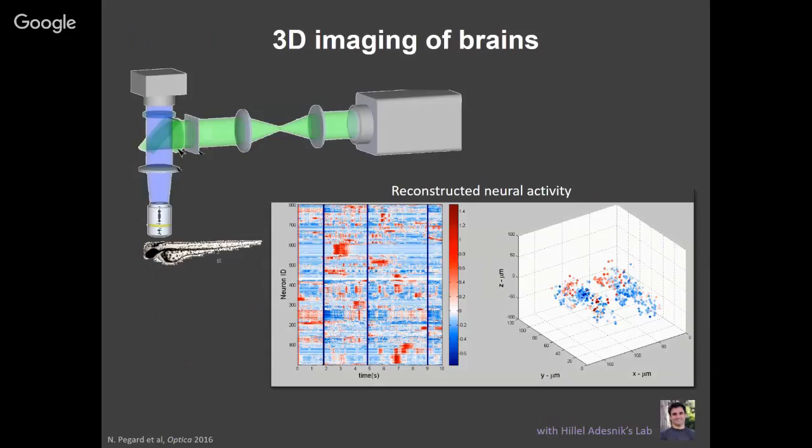Okay, so then finally, we can do exactly what we wanted to do, which is to track the activity of every neuron over time. And this is a map. This is the 3D map of where the neurons are, and then the color represents their activity at a particular time. And this particular experiment is just this zebrafish hanging around, not really doing much. So it's hard to validate this actually. And you can see some areas, these blue lines, are where the zebrafish just flinched or tried to run away and the dictionary became invalid.